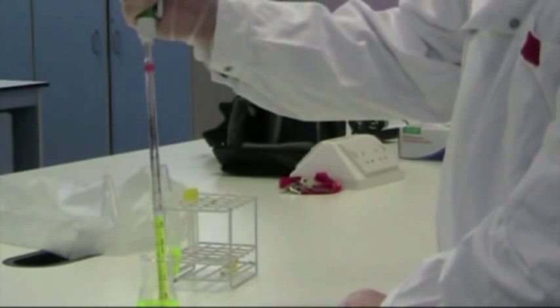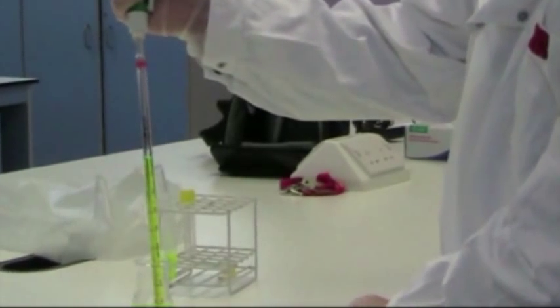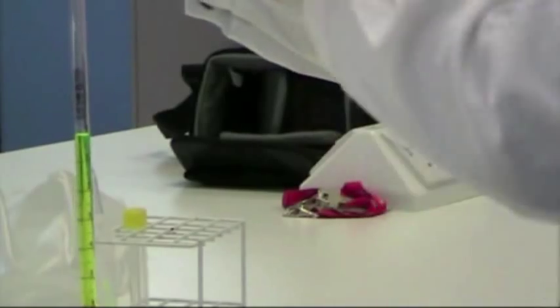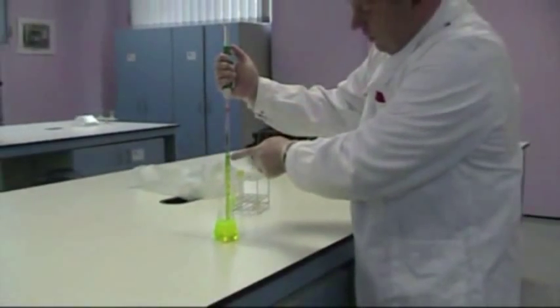So for this example, I'm going to dispense 1 mil, or 1 cm³. So we draw it up to naught. Remember to check the meniscus, and then to dispense, it's simply a matter of reversing the thumb action back down to 1 on here.